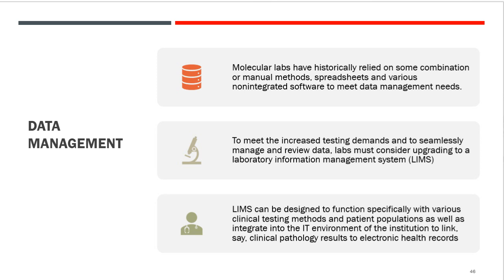The thing to keep in mind perhaps about upgrading to the laboratory system is, remember the two conversations with your accreditation inspector. Conversation one was you followed a protocol, or in this case, maybe you purchased from a commercial company a laboratory information management system. When the inspector says, so how do you know your information system is working? Well, the manufacturer runs this sort of validation, et cetera.